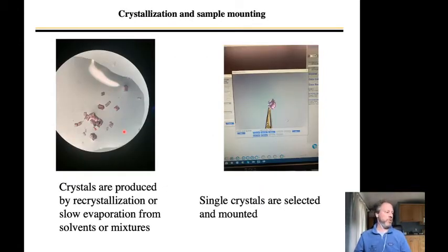So here are some crystals of a complex made in the Van Hoevelen lab. I believe that this is a nickel cyclam, but I don't remember, and I don't have access to the instrument, so I can't double check. But these are crystals being viewed through the microscope. They're on the order of 1/10 of a millimeter to a millimeter on a side. They're very nice crystals.